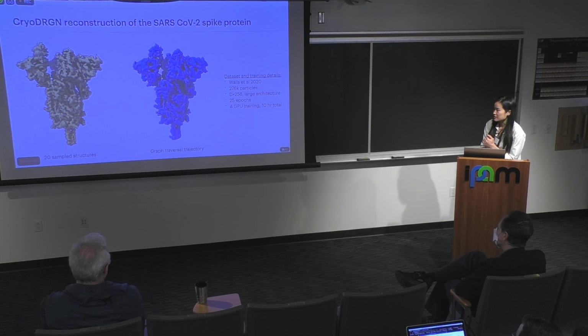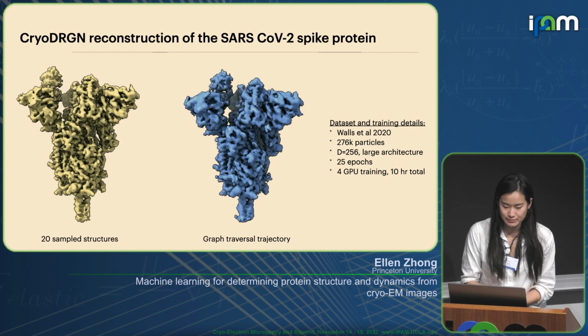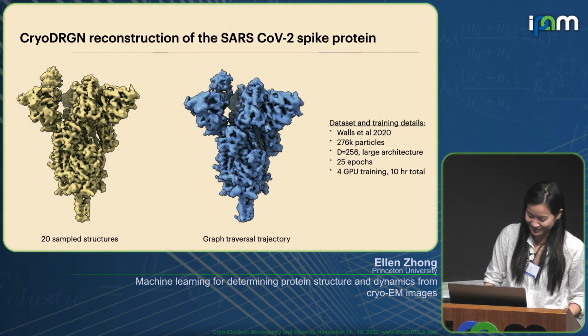And just for some data set and training details, this had 276,000 particles, took approximately 10 hours to train on 4 GPUs, not counting the filtering and the learning process.